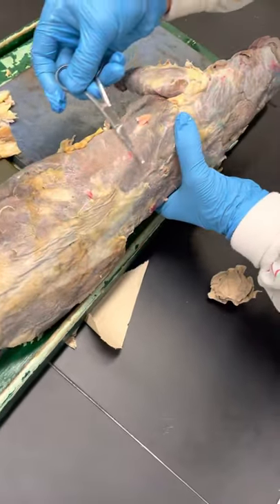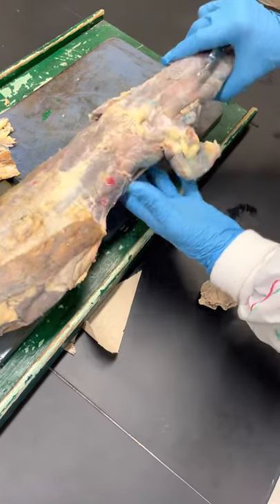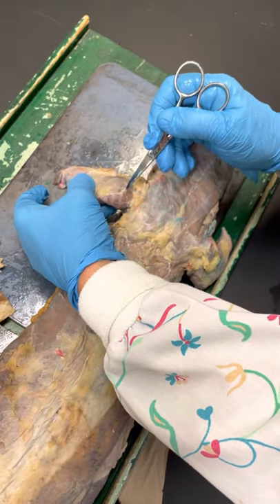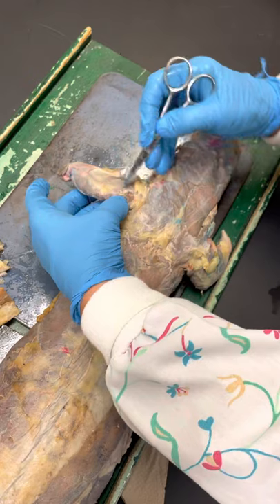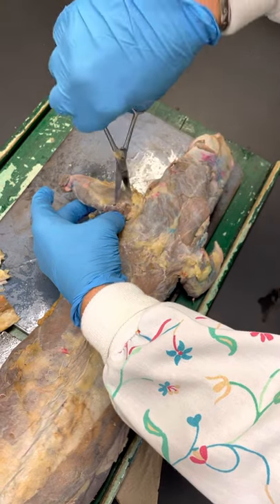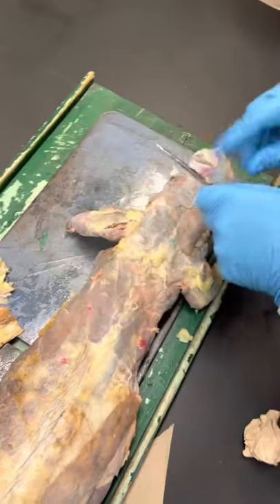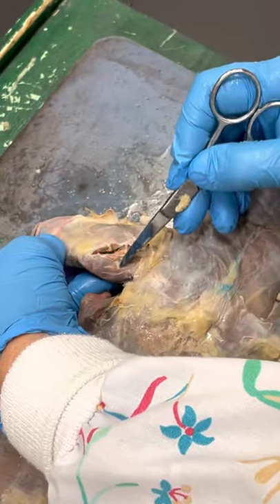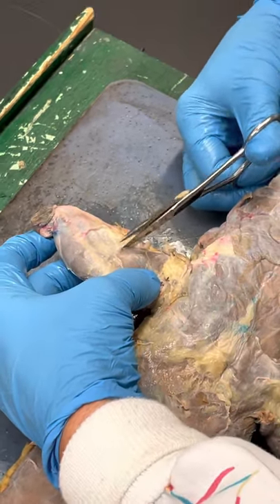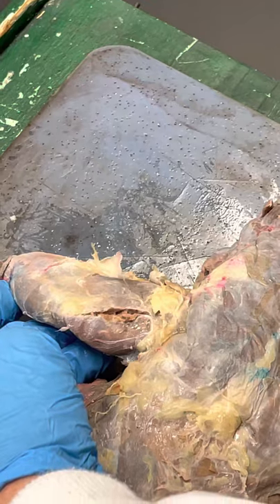This whole broad band underneath here is latissimus dorsi, so they're all in the same places as ours. On the arm, I'm only going to have you know two muscles. There's a white line, and I'm going to actually separate it so you can see the two muscles. This one is long head of triceps, and this one is lateral head of triceps — the same two heads of triceps just like we do.